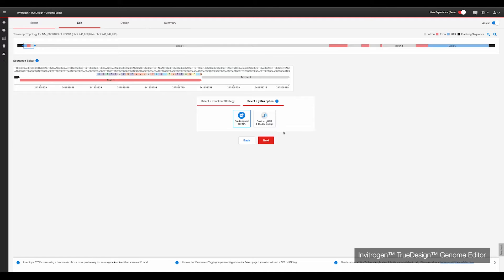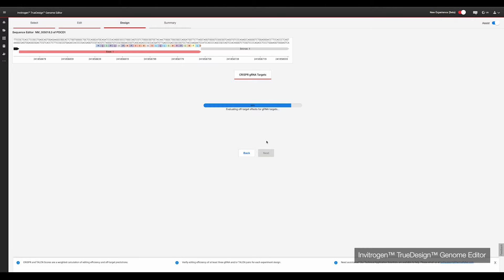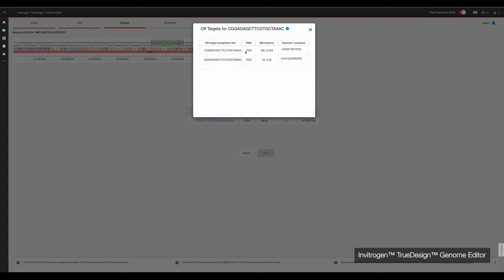Clicking Next initiates TrueDesign's algorithm, which will scan the desired edit site region for all proto-spacer adjacent motifs, or PAM sequences. It will then rank the recommended gRNAs for performance and specificity, and filter out those with poor off-target prediction. If the site you are targeting lacks a PAM for CRISPR, TrueDesign will design TALENs to target the desired edit site. Clicking the off-target number gives you a list of the possible off-target editing sites.